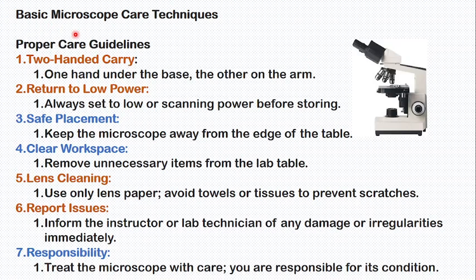So let me talk about basic microscope care. How can you care for a light microscope? It is like when you take your phone, you just put it wherever you want, you don't care. Is it the same to take care of a microscope? No, because a microscope is an expensive material. It should have specific care. Like those Rwandans who still have culture, when they greet elder people, they give with 2 arms. That is the same way you should carry your microscope. You should carry your microscope with 2 hands.